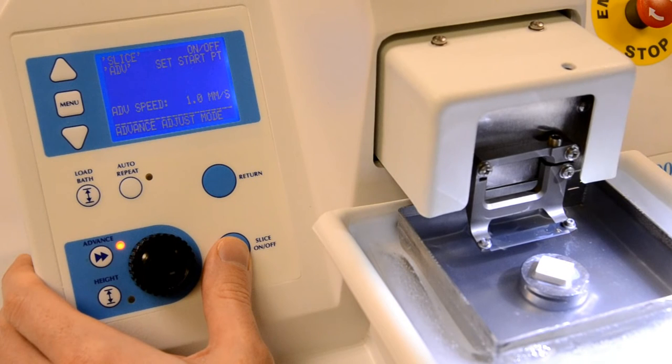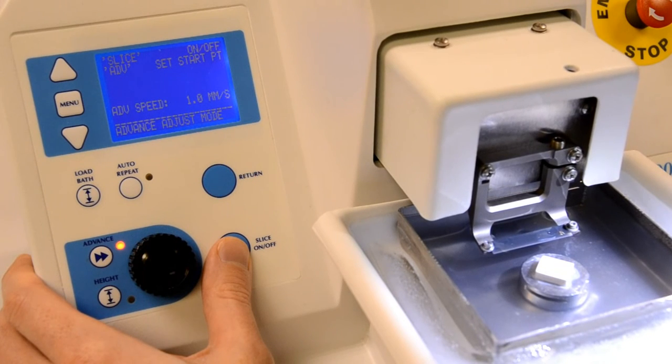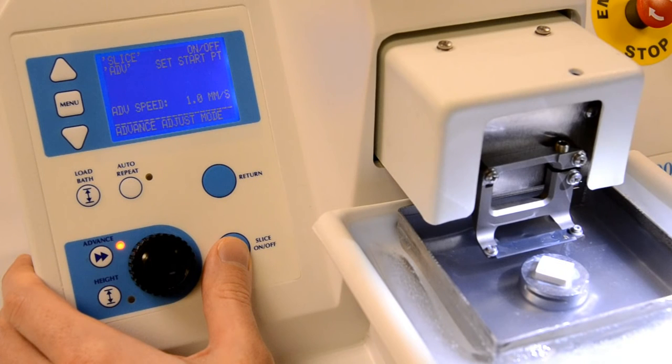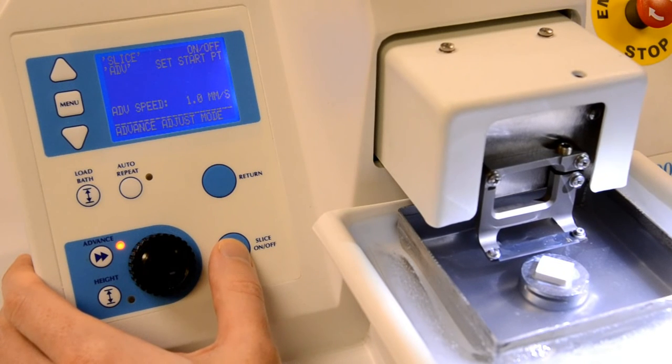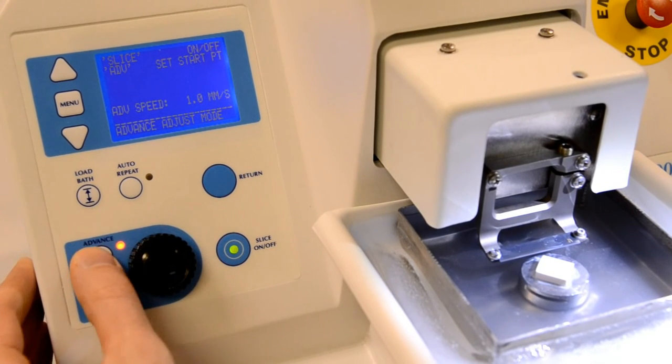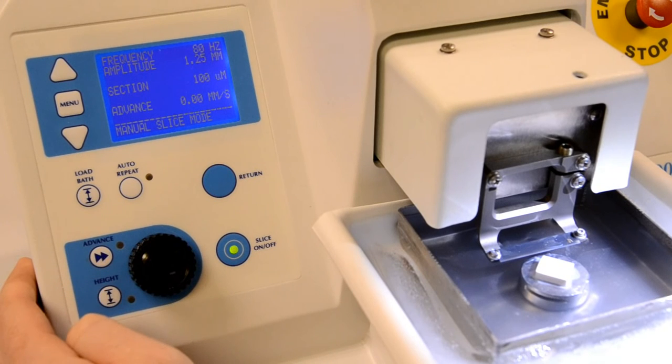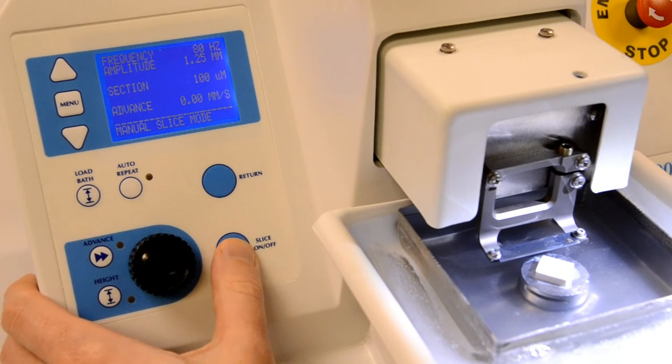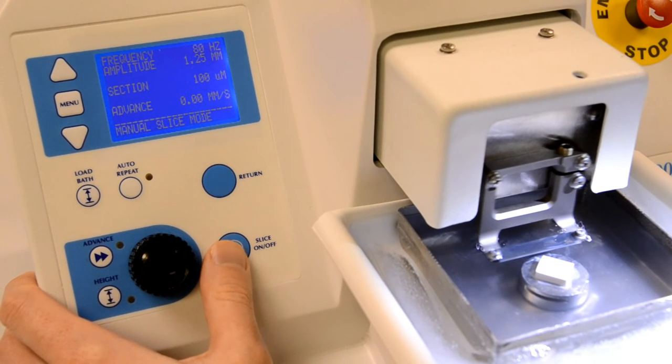Note that the rotary knob will allow you to reduce the advance speed past zero into negative values and move the head backwards. When the head is in the desired position, press the advance key again. This is the position to which the head will return after a slice is taken and the return key is pressed.